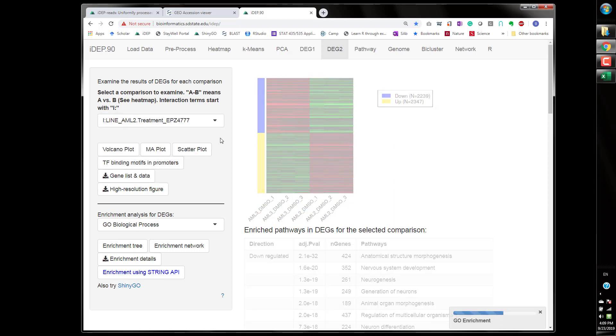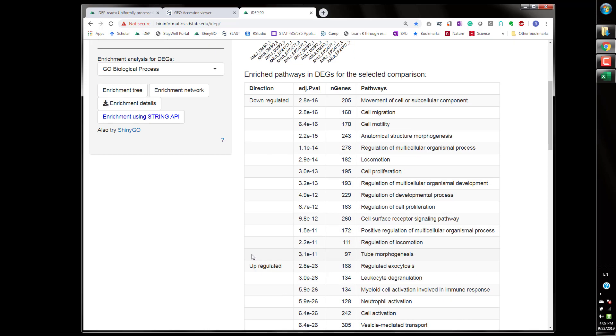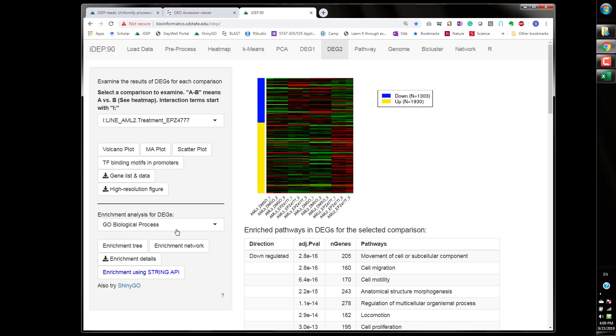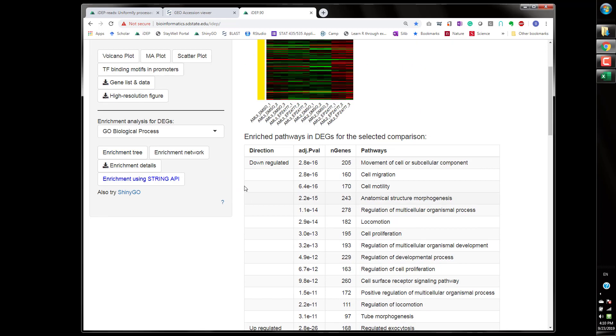The most interesting would be this interaction term so this is the extra effect the extra response in ML2 cell line to the treatment of this chemical compound. Let's see these are genes that are uniquely upregulated in ML2 and these are uniquely downregulated genes in ML2 compared to ML3.